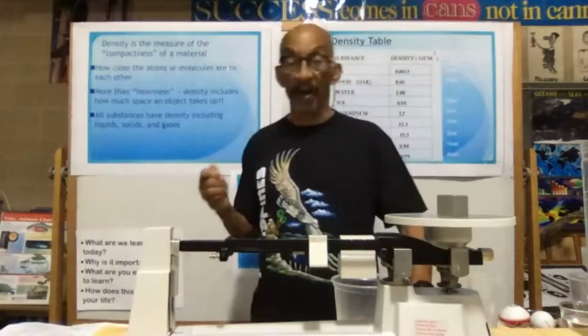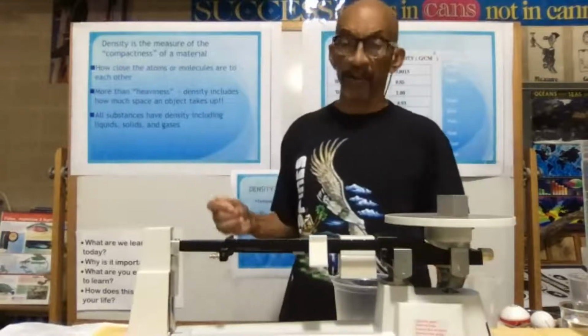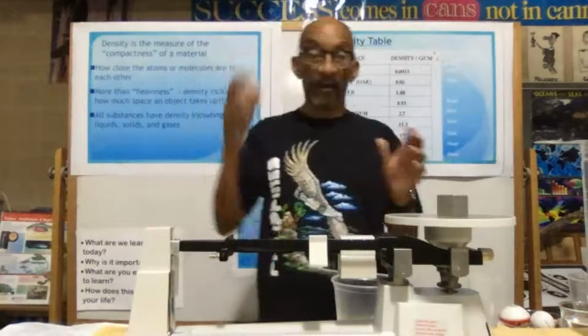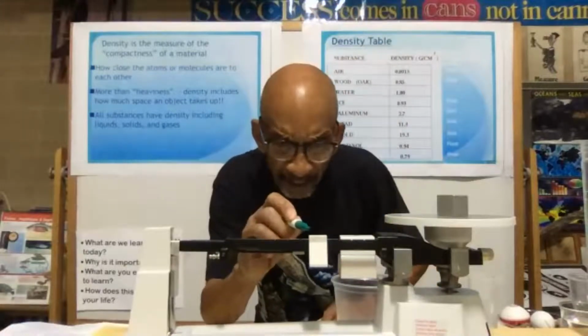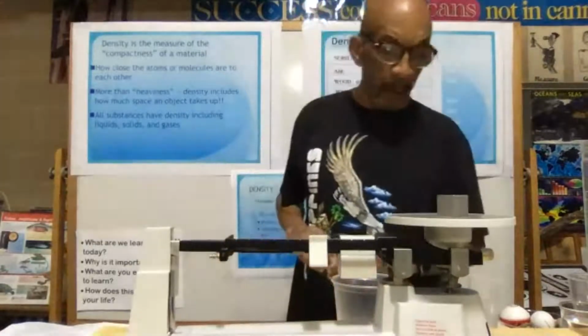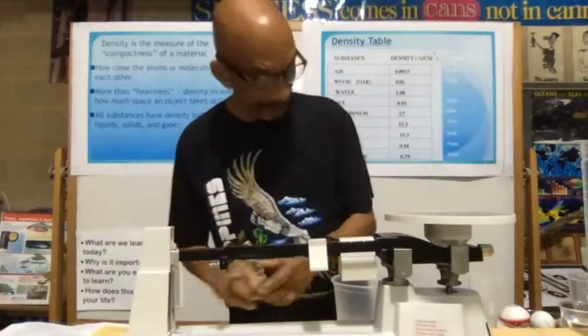When we're talking about volume, we're talking about centimeters cubed, okay? Those are the two different measurements that we're going to be using today. So I'm going to write this down. 45.4 grams is what the mass is. Okay, you guys got that.